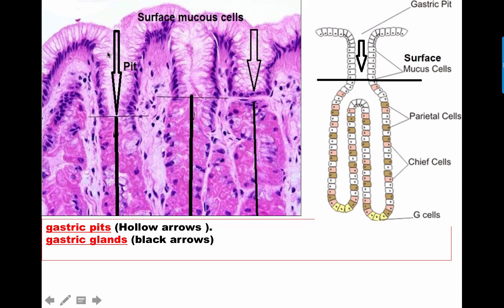The gland itself is formed of three parts: the isthmus (the first narrow part), then the neck (the wider part), and then the base (which is the branched part). You can identify the pit by the presence of tall cells with basal oval nuclei whose apex is vacuolated or appears empty due to dissolving of the mucus, creating a large pale space in the cells.